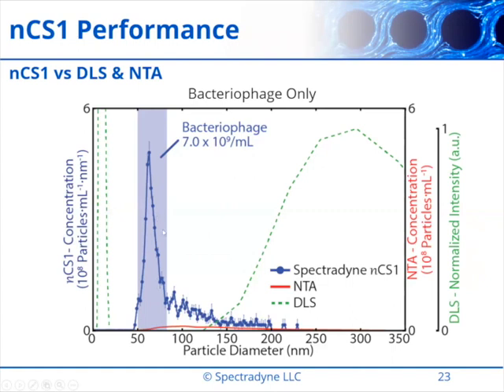One more thing I want to point out is, it's always nice to see this peak, gives us a good feeling that everything's working. However, to a researcher interested in this phage, they might actually have more information for what's going on off peak. So there's an asymmetry to this peak. There's quite a tail. Maybe the phage is dimerizing. Maybe there's remnants left over, or the purification protocol is not working very well.